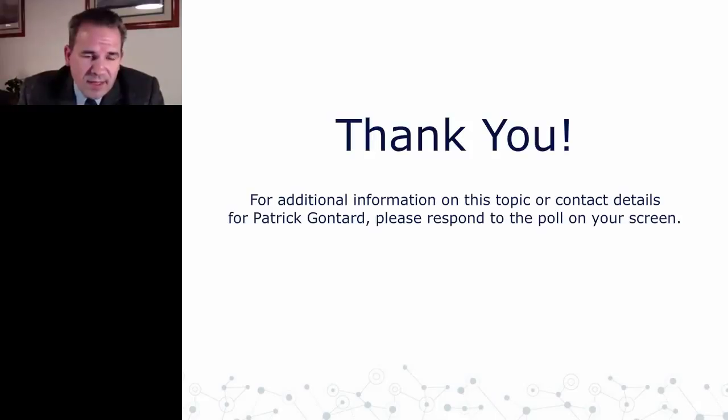We quantify how easy it is to do a rerun when you have a middleware versus when you're directly plugged into the LIS. So yes, it shows, and we quantify it in the model, and we see it in the model, and that also enables the people that are dedicating time to the selection of parameters and the selection of variables to program the informatics to do their work better.